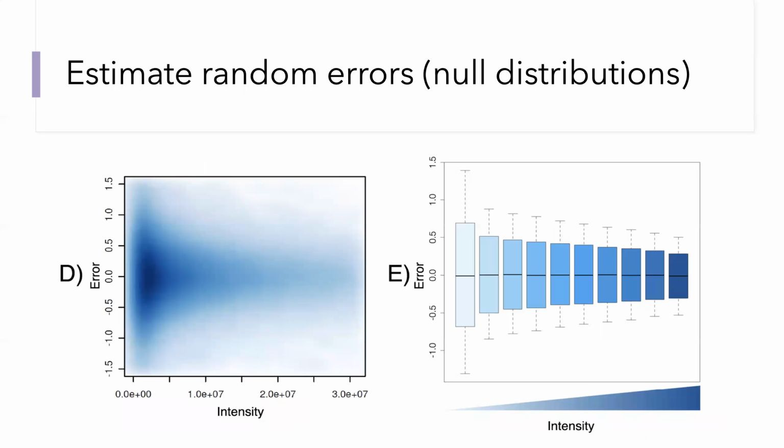Of course, there are also random errors, and these are much easier to handle statistically because simply by averaging measurements performed multiple times, we can reduce them, and it is easier to handle them in terms of established existing statistical models.